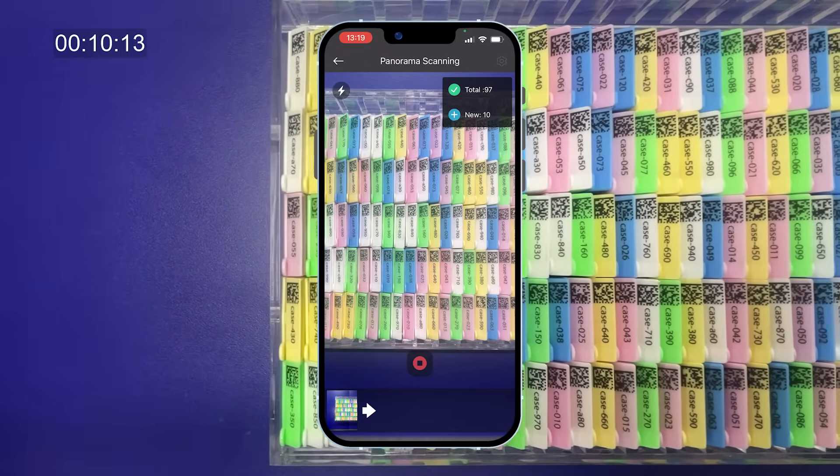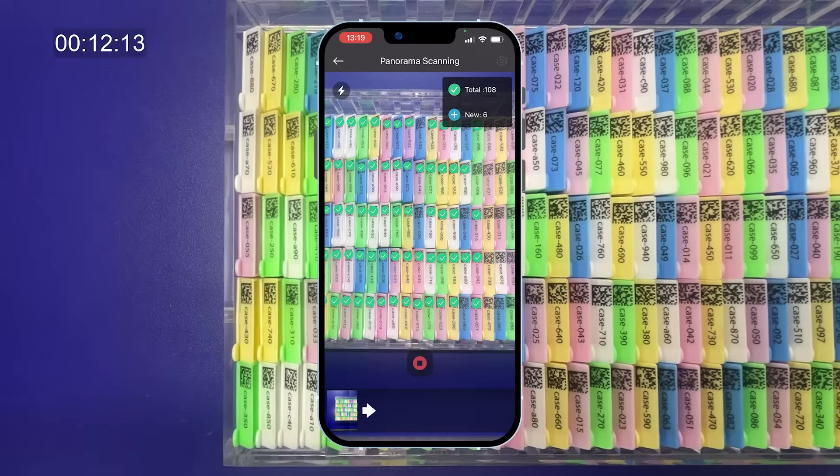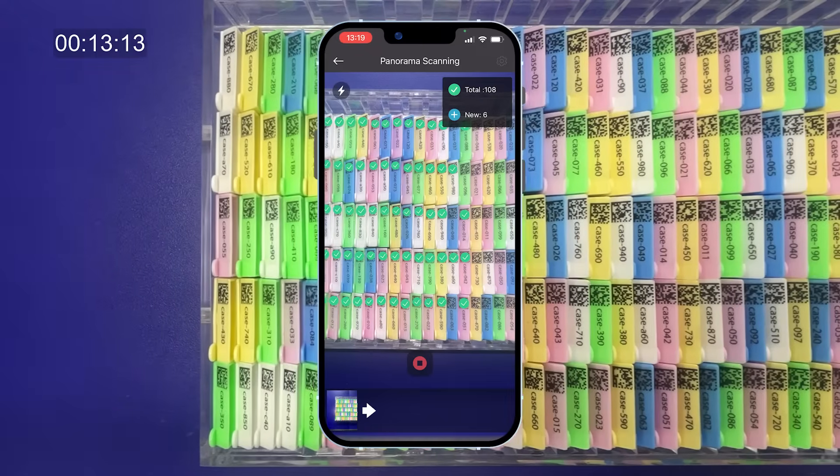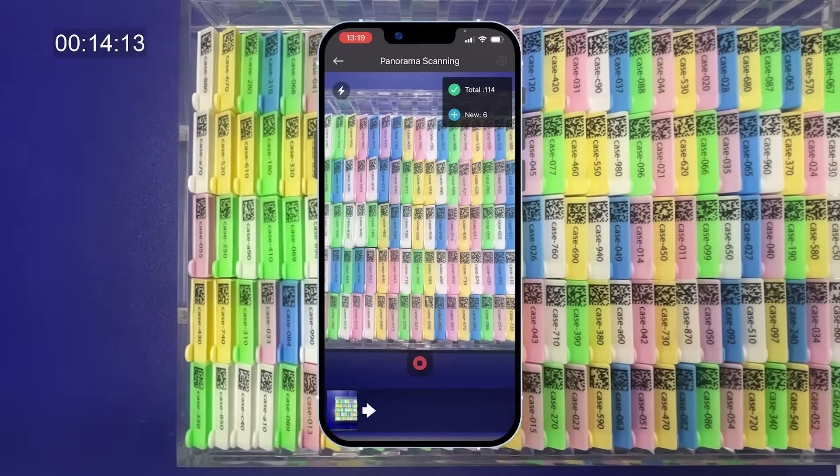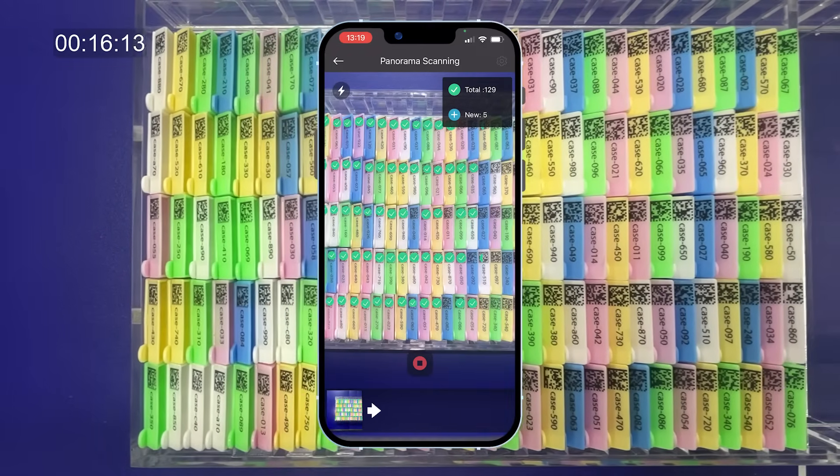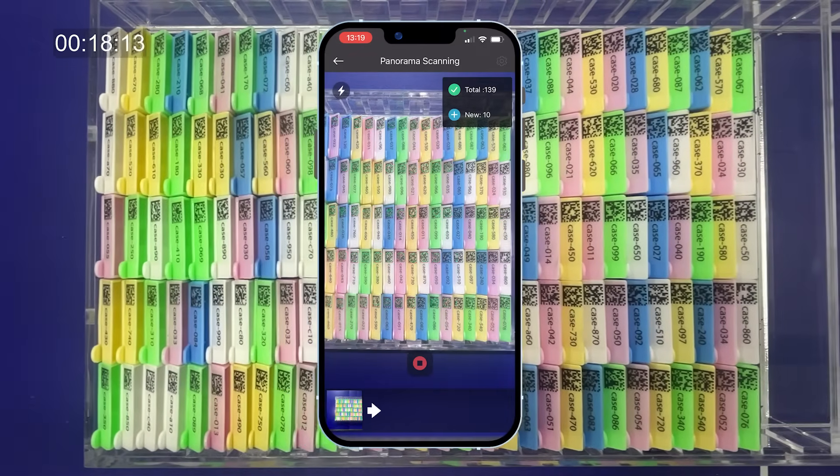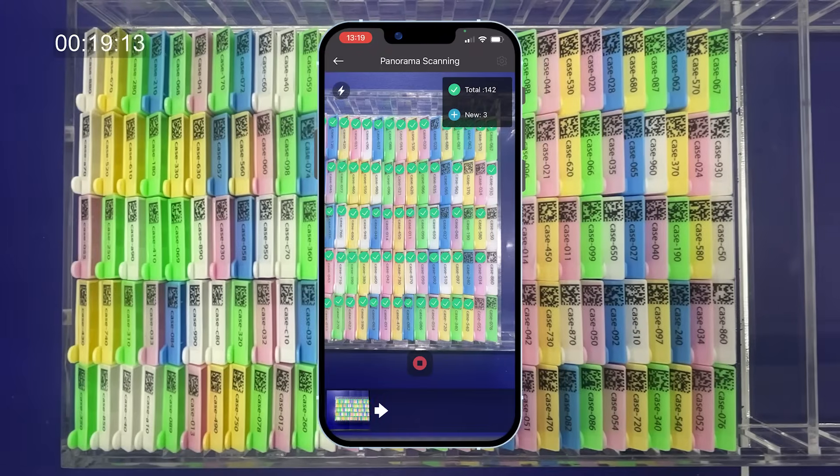With Dynamsoft Batch Barcode Scan, a smartphone can scan all 150 cassettes in just 30 seconds. And now, our AR technology provides real-time scan previews.